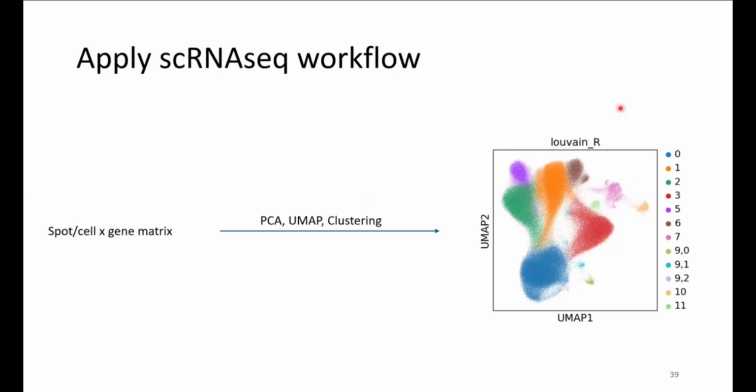And now, if you think about Visium or also Xenium assays, why would you expect maybe to see this kind of mixture cell types? Right, if you're in a Xenium image-based assay and you don't get segmentation right, transcripts are assigned to the wrong cell, and then things look like a mixture cell type. Or in Visium, in the grid-based assays, you can have a cell which spans multiple of these spots, or you have a mixture of cells on a particular spot, and then you get this kind of mixture cell types. You can kind of overcome that by revisiting cell segmentation in part.